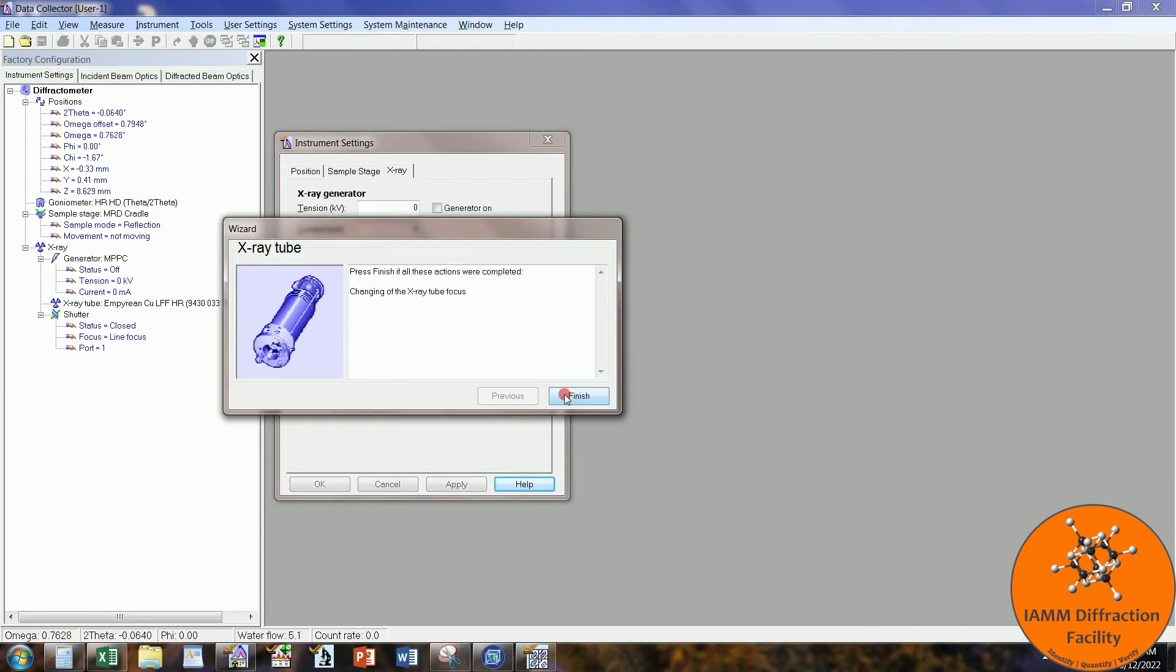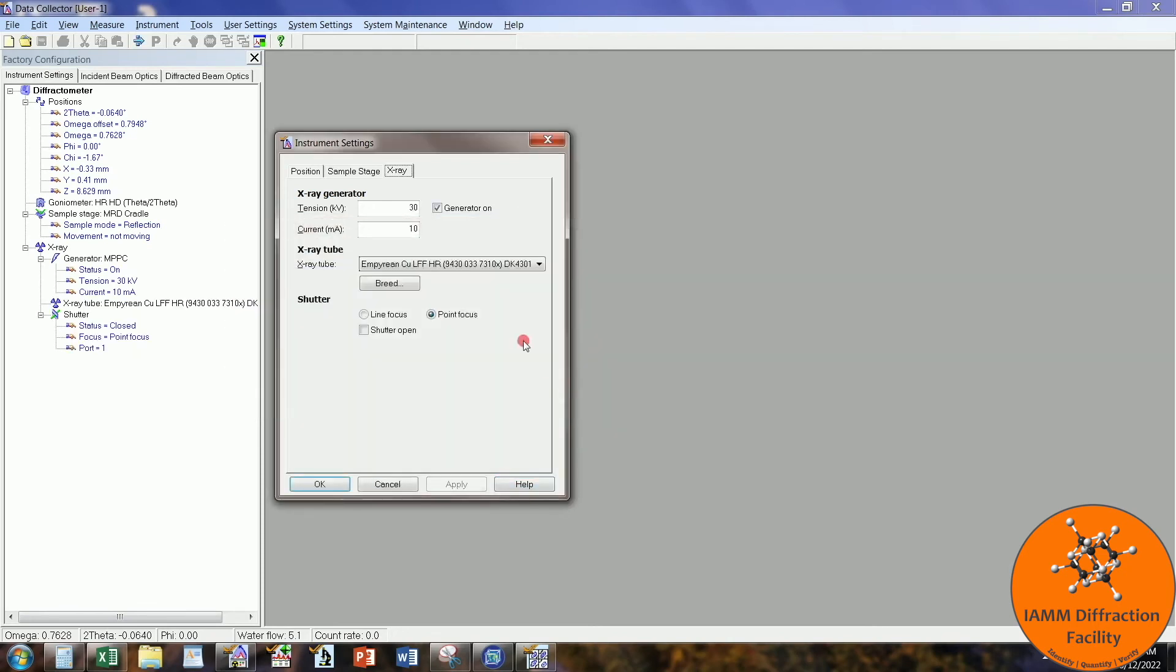We can click next on the screen. And then you can turn your tension and current up to 45 and 40. And then you are good to go in your point focus mode.